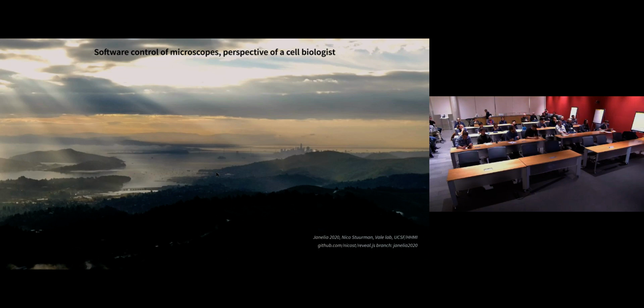I bring in my user experience. I develop optical microscopes, so I'm on the consumer side of LabVIEW or Python, Micromanager, these kinds of frameworks that drive the microscope. A lot of you are experts in writing your custom software or dabbling with Micromanager. I'd be really curious to hear your experiences, your teaching moments, and what you'd like to see in the next-gen software. And like Stefan said, we'd like to converge on a few things that we all can agree on, and hopefully with that momentum go forward.